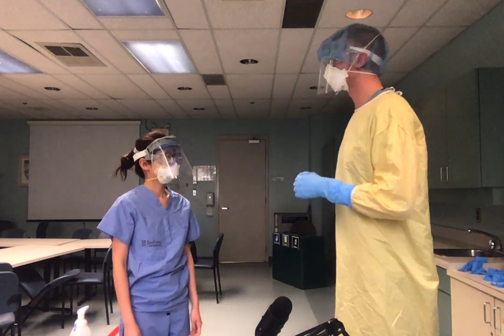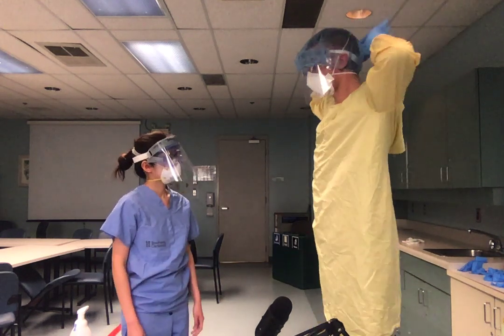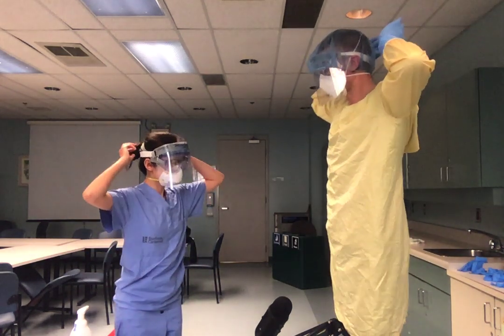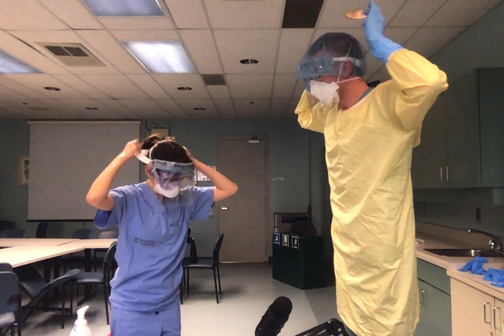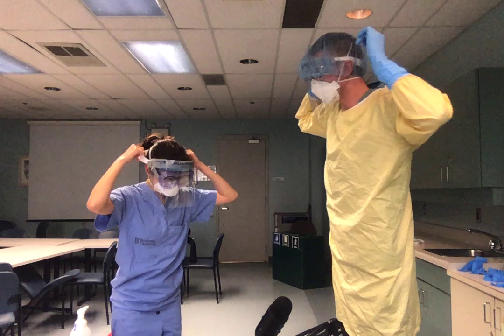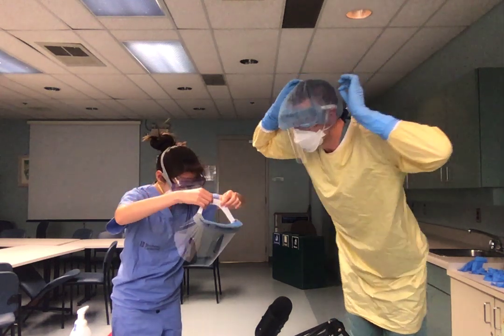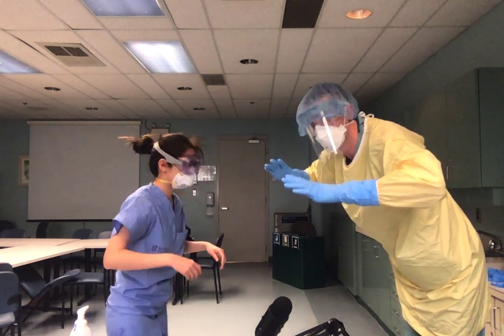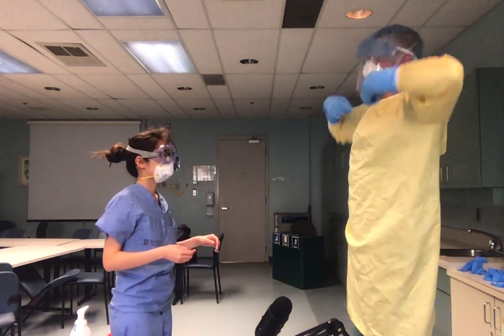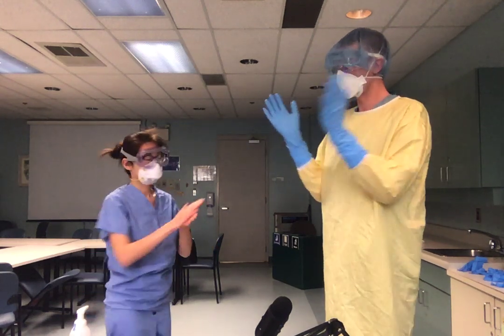So Nancy, I want you to reach for your face visor now. And an important detail is to really grab it from behind. Okay, Chrissy, can you do that for me? If you're not sure what strap is what, you can pull on it a little bit. And you can hear her face shield is making some noise, so she's in the right place. And we're having her hinge forward at the hips so that this face shield just falls away, right? If we're standing straight and tall, it could contaminate us on the way down. So Nancy, show that you're washing your hands again.